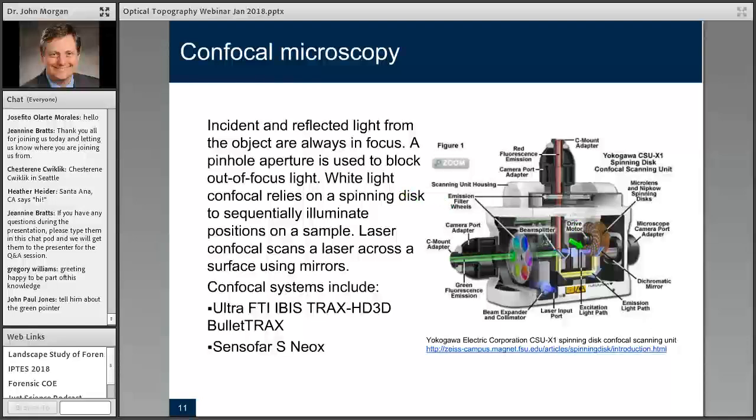Just click around the picture, and that will follow your mouse click. There you go. Here's what is called the Nipkow disc. These pinholes control which light reflected from the object actually comes back into the detector, and ensure that only in-focus light comes back, and therefore that only the light from a particular plane makes the topographic image. As a result, in order to build up an entire topographic image, you need to scan across the entire object, and this can take some time. But these systems have come a long way, and you're able to do these within seconds or minutes now.